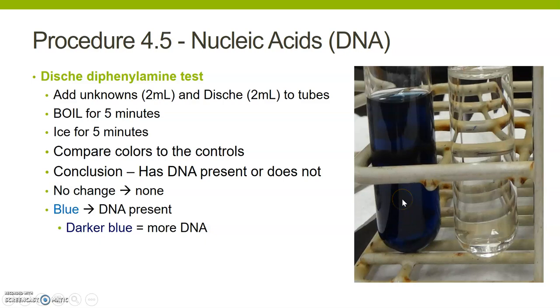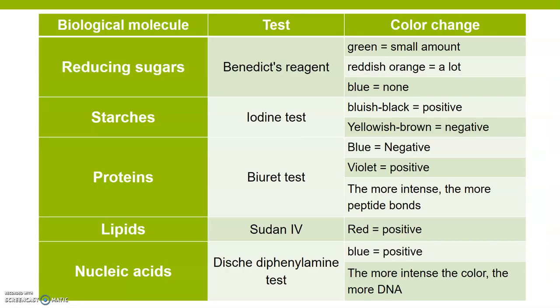So again, just like we've talked about in previous tests, the darker the blue, the more DNA that's there. So if there's a lighter blue color, it's still positive. It just means there isn't as much DNA present in that solution. Okay, so if you have the PowerPoints of this, here's kind of the general overview of everything: the test, the biological molecule it's looking for, and then what color it will change.